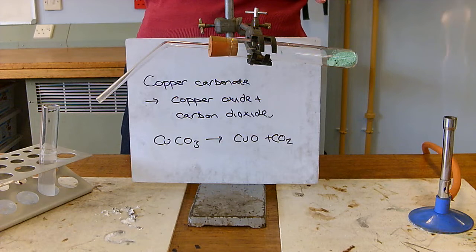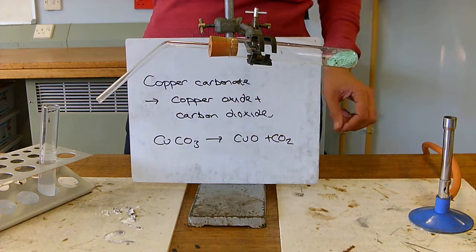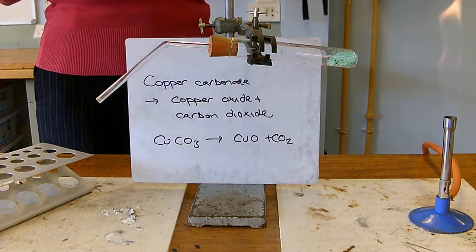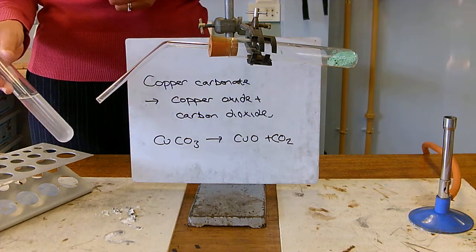So, I've got my copper carbonate in my boiling tube and I'm going to heat it up. We'll know reactions happen because there's a colour change and we're going to make a gas. We can test for carbon dioxide using lime water. So, I've got some here.